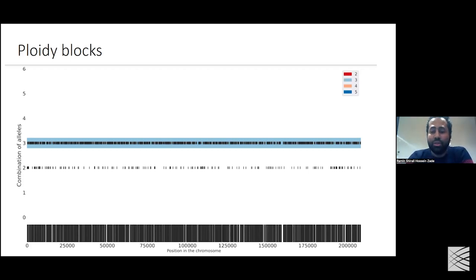So my personal opinion, based on the experience that I had with plants and also with yeast, is that 20x per haplotype is the minimum. I guess you already get good results with 20x, but 30x is a little bit better. You are more confident with every action that you are taking. And more than that doesn't change the results that much, but slows down the tools.